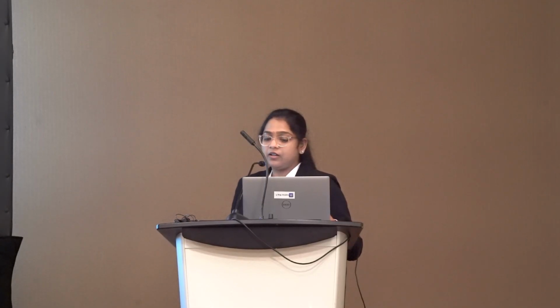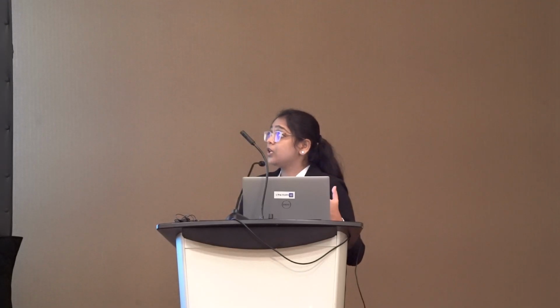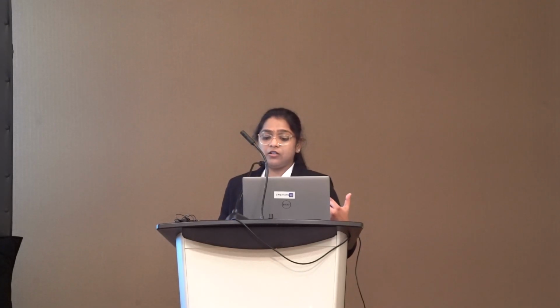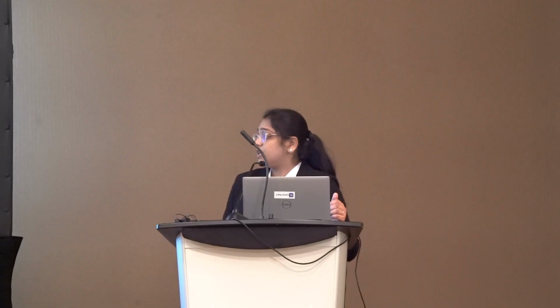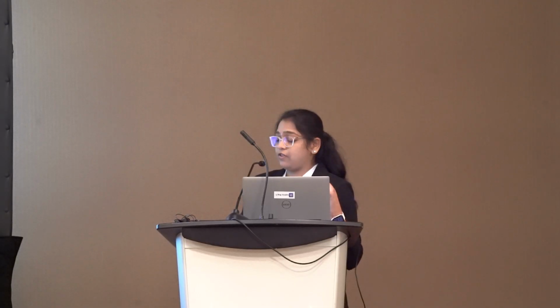Here we can see phosphatidylcholine processing is downregulated. That means the lipids are breaking down under the salt stress. And at the bottom we can see the jasmonic acid synthesis. That means at the end of this, the jasmonate is involved in the stress defense pathway.